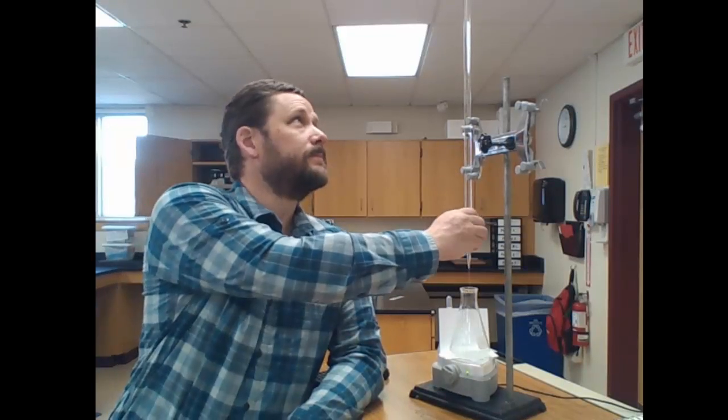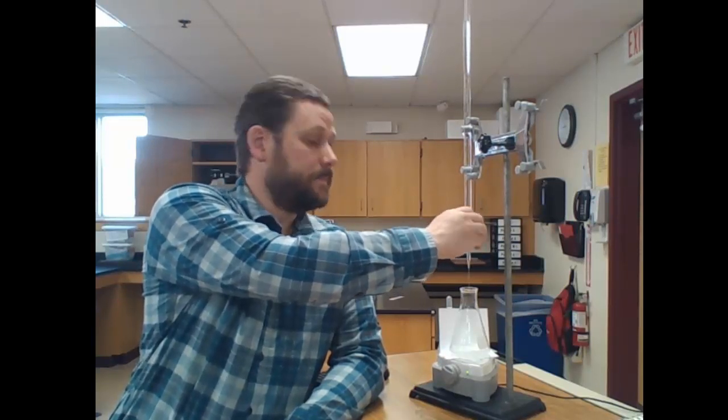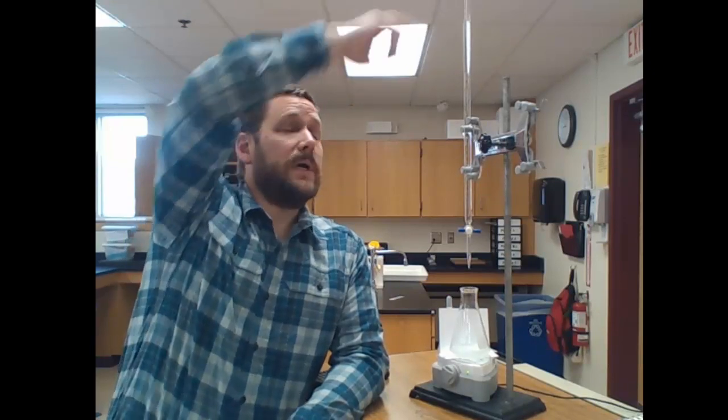As I continue to add base, we'll see that pink color stays a little bit longer each time. There's the second mil and the third mil. Now, I'm estimating, and reading a burette can be done with a great deal of precision. So in a more careful lab technique, I would want to record the volume of base each time. In this case, I know where my endpoint is approximately, so I'm going to jump to the point where the solution is starting to retain that pink color for a little bit longer.